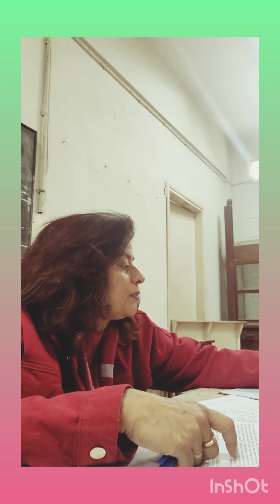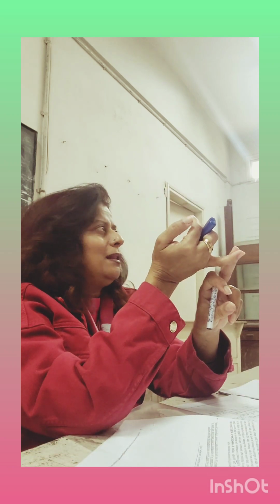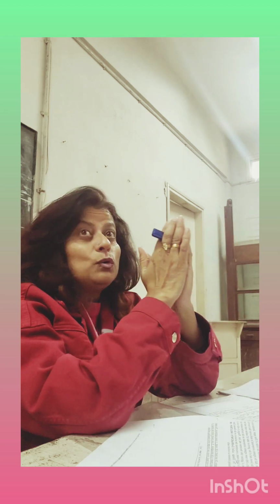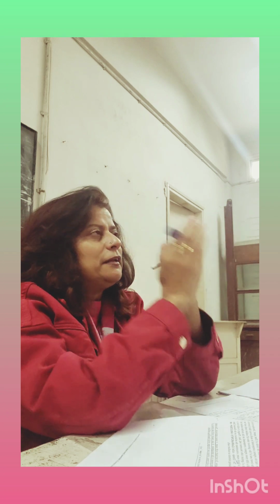The first test you're going to write here is the test for nitrogen. You will use a test tube which is reusable, which can be washed and rinsed. In the test tube, you're going to take 1 to 2 ml of sodium extract and then add ferrous sulfate solution. I've written here 3 drops of ferrous sulfate because the amount was not mentioned, and heat to boil.